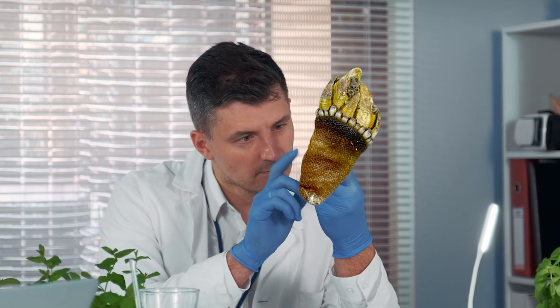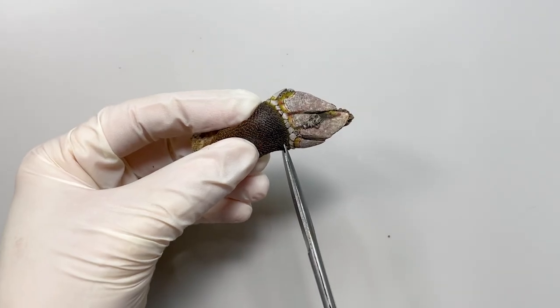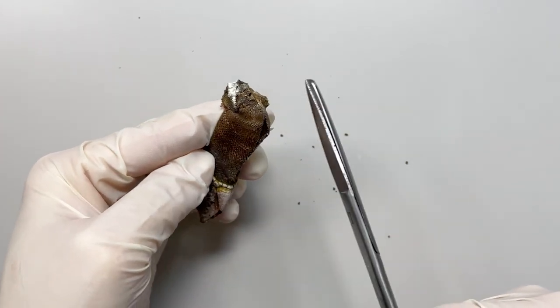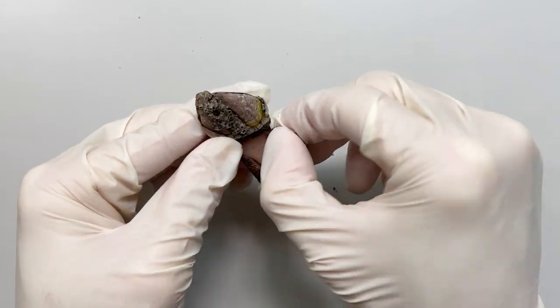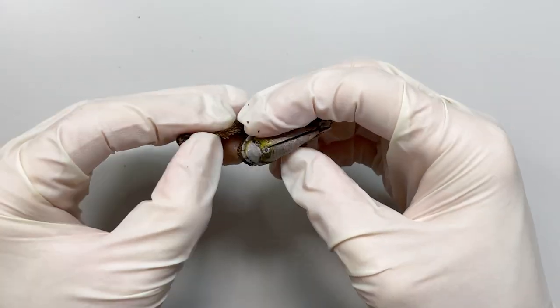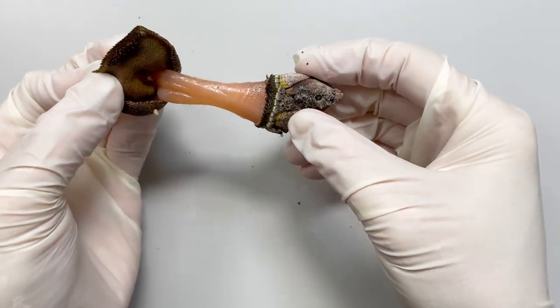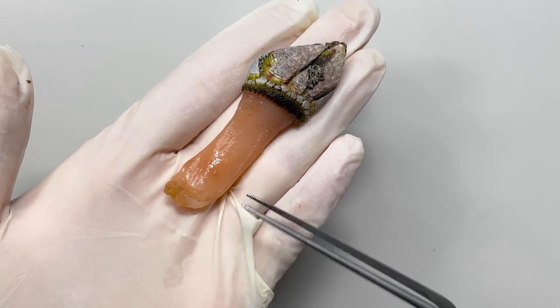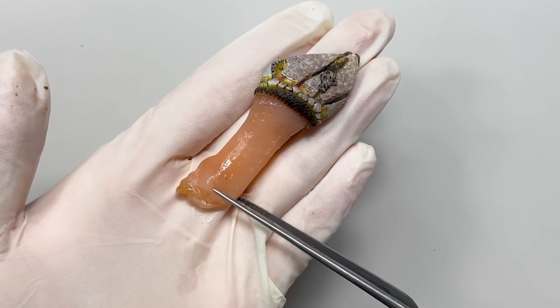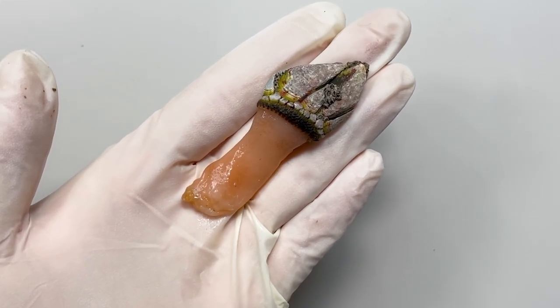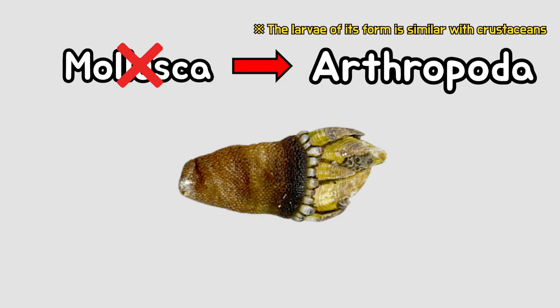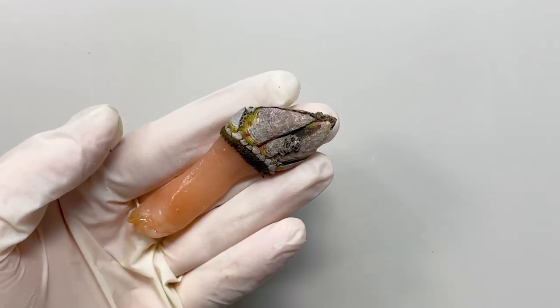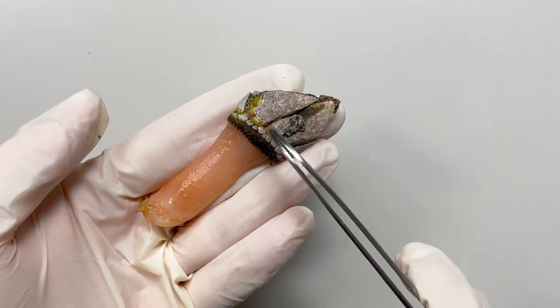What kind of creature is this? Let's dissect the gooseneck barnacle. First, cut the stalk and then peel off the skin. Then you can see the soft flesh inside. It is similar to the flesh of a clam. Gooseneck barnacle was classified as mollusca, like clams, until the 19th century. But now it's one of the arthropods. The inside of the stalk looks like a mollusca, but the inside of the capitulum is very different from clams.